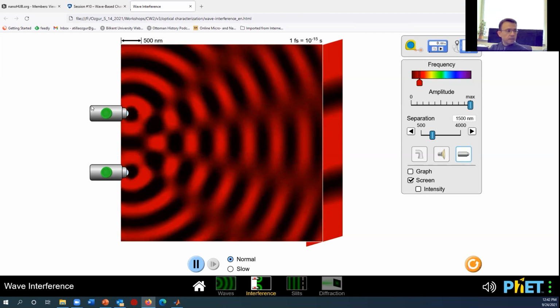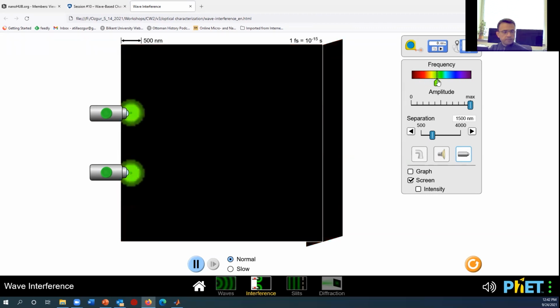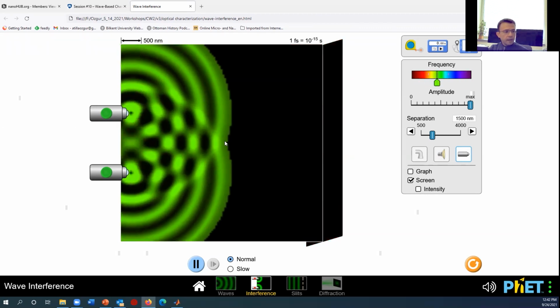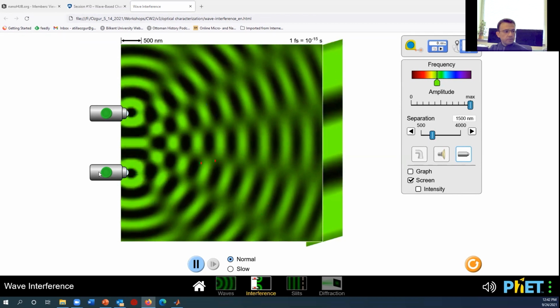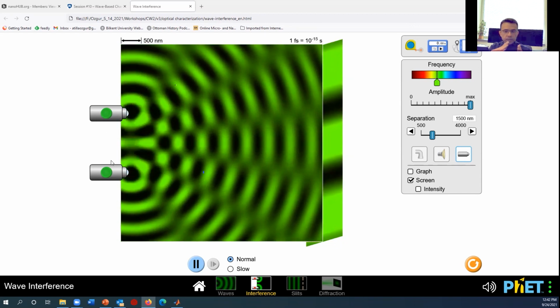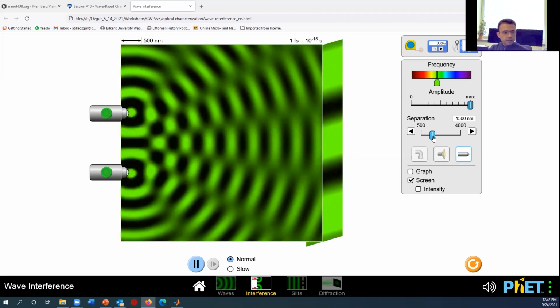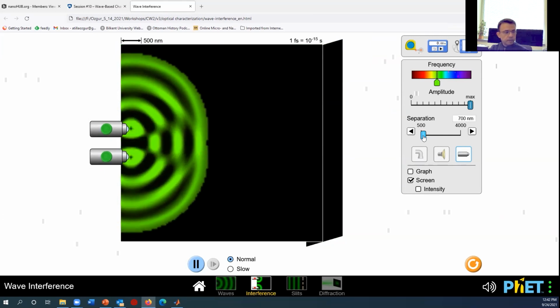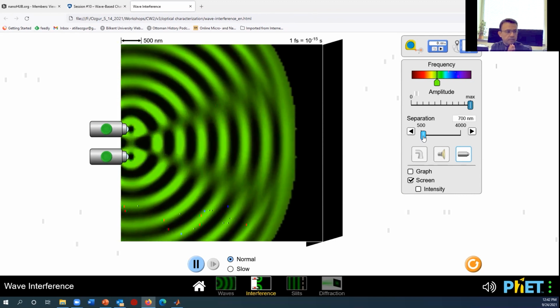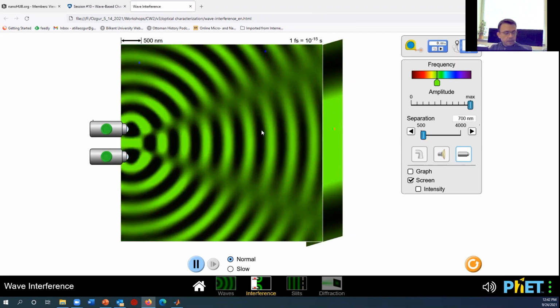The other thing is about this distance. So these are separated, right? So let's just fix the wavelength now, or the frequency. The separation between these two sources, which in this case will be our planes, crystalline planes in the case of XRD, will also be different. So as the separation distance is getting shorter, in this case, it's meaning that these diffraction planes are getting closer to each other, as you can see, right?